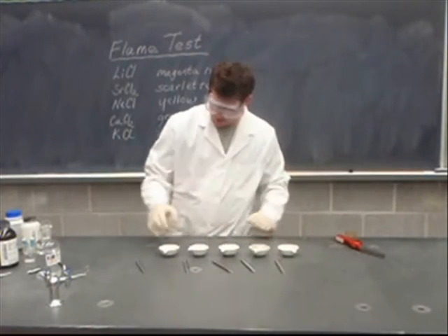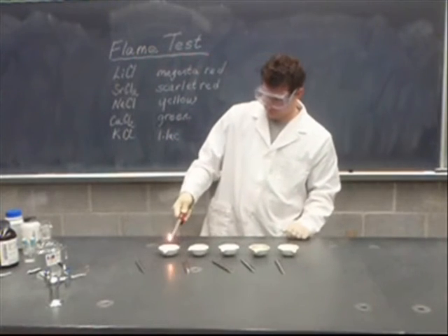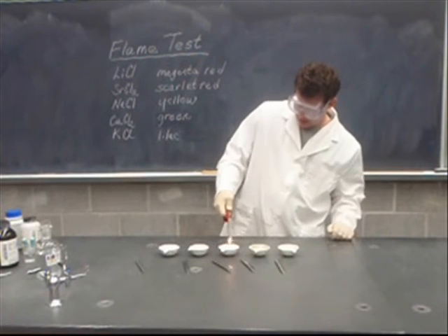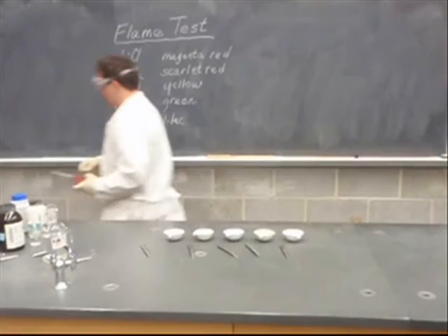Now the cool thing about methanol is it burns colorless. Now I know they've all lit because I heard them pop. That's when the methanol ignites. Now if I go and turn off the lights, you will be able to see the methanol burning. Now let's see if we can zoom in a little bit.